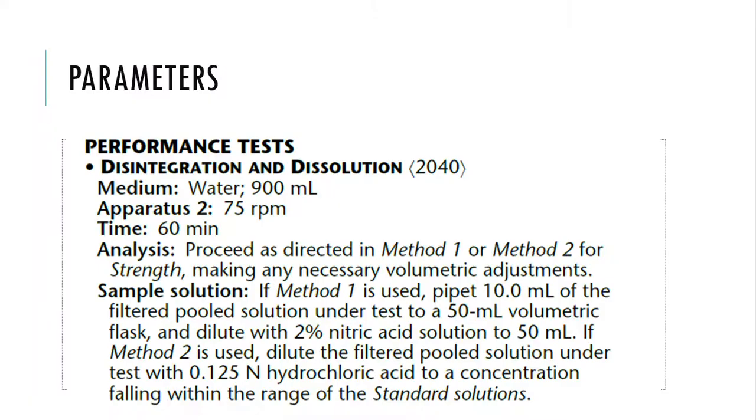All right, so again, we're going back to zinc citrate. This is the monograph that was pulled for zinc citrate. It is verbatim what is inside of the USP for this particular type of supplement. So we are going to be using water in this experiment. When I go over to the dissolution vessel or disintegration, I'm going to be measuring 900 mils of just water, and I'm pouring it into that vat.